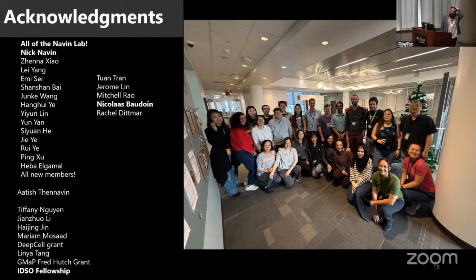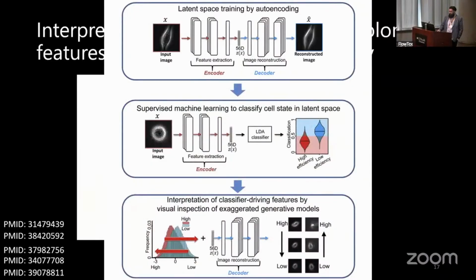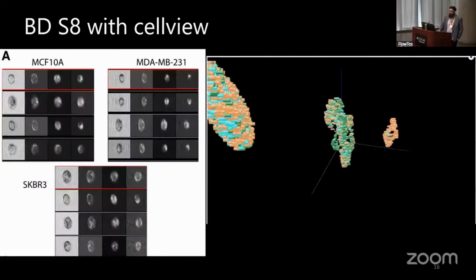I work at BD, so it's really exciting to see some of the S8 images being used. It looked like you had a fluorescence channel as well for mitochondrial. Did that clearly add anything to the ability to classify here when you're comparing to the purely label-free?